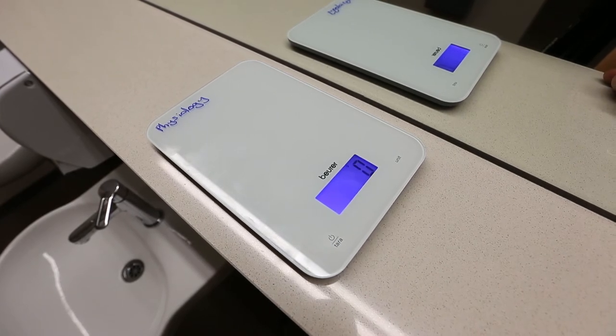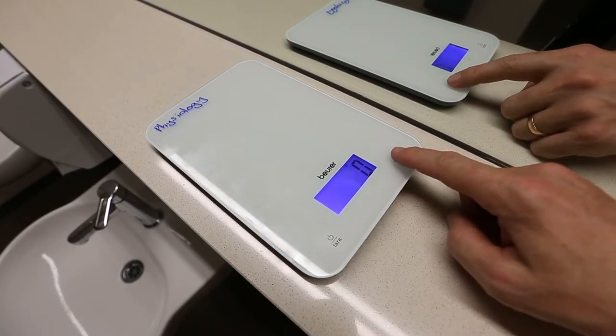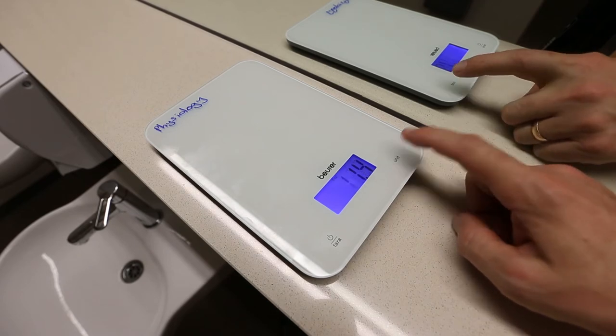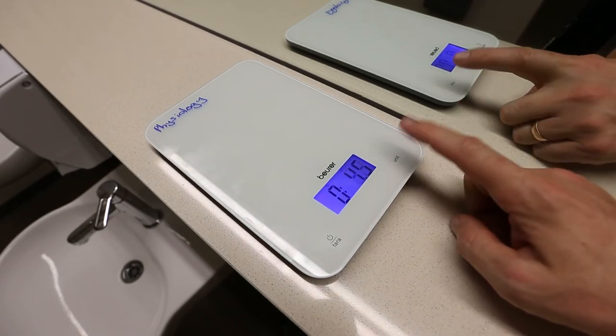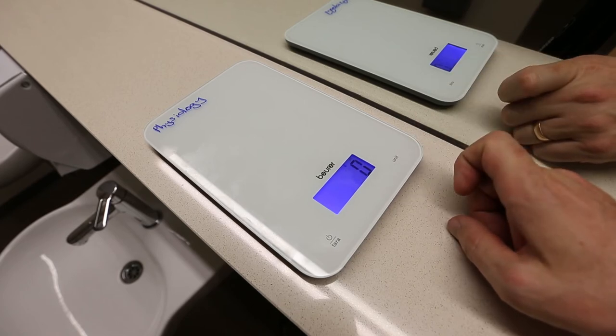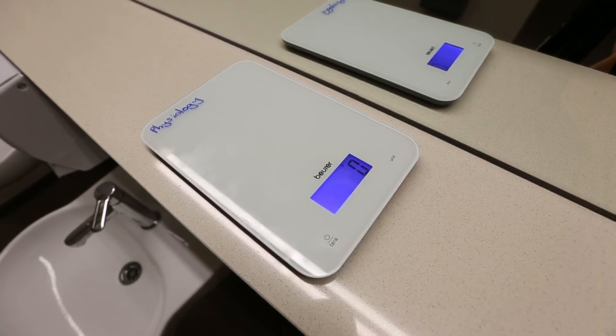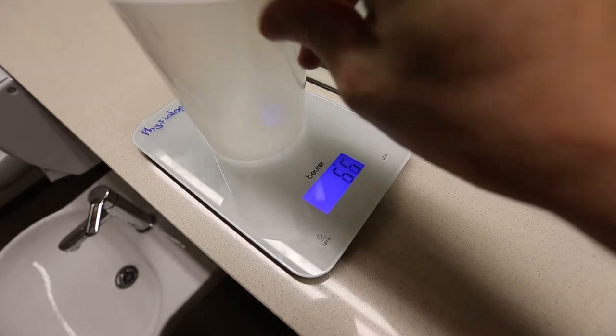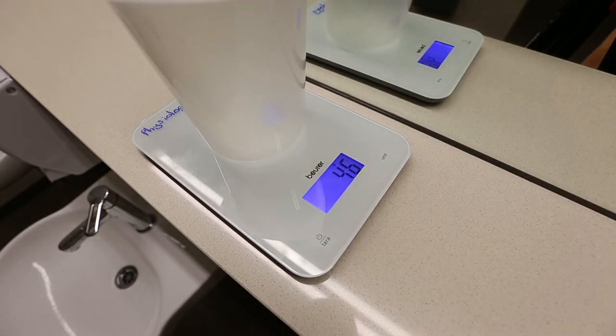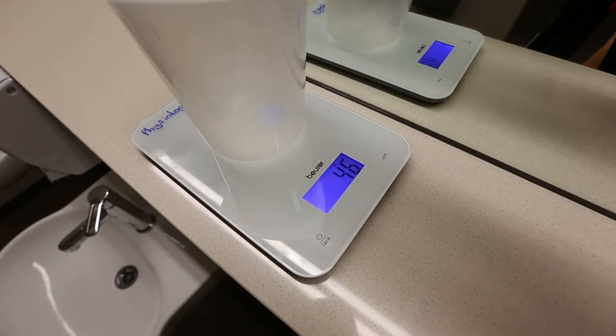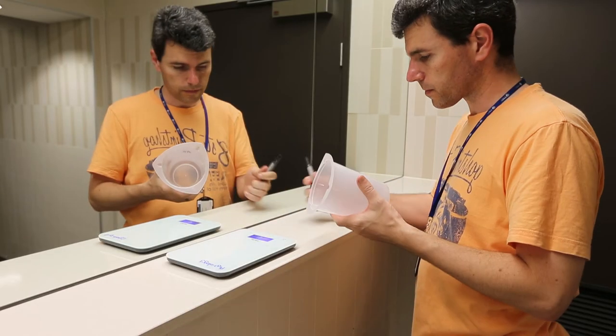The scales measure in several different units. If grams are not being displayed, press the units button several times until grams is displayed at the top of the screen. You can then place your empty beaker onto the scales. In this example, the beaker weighs 46 grams. You should write this empty weight onto the side of your beaker.